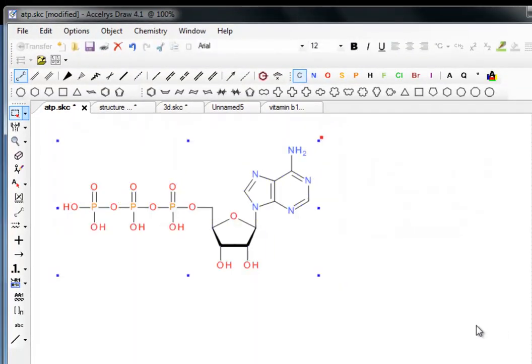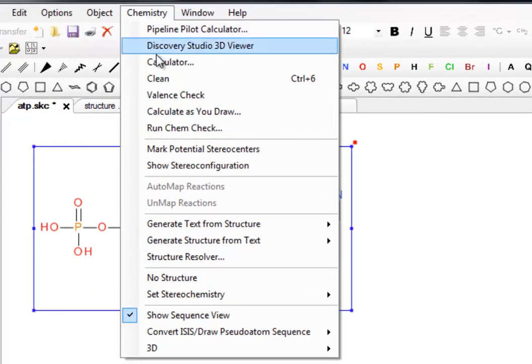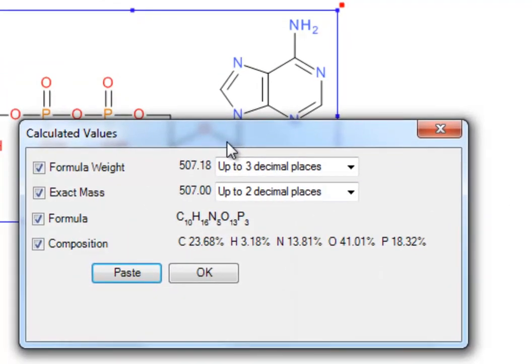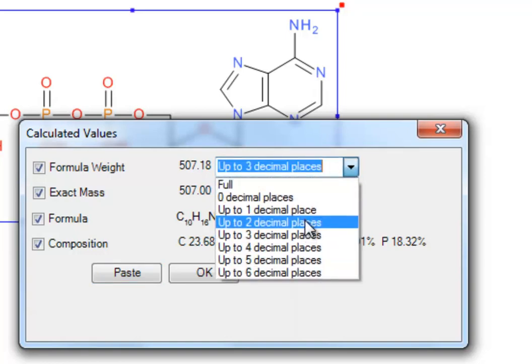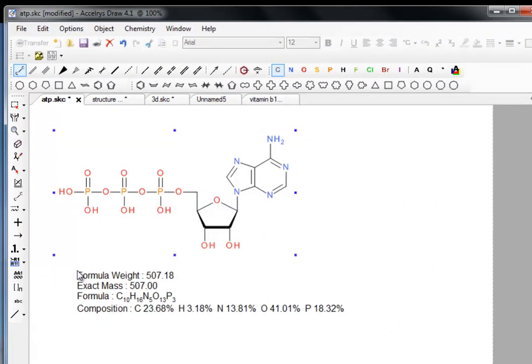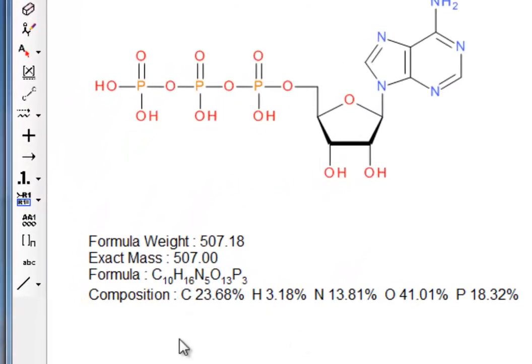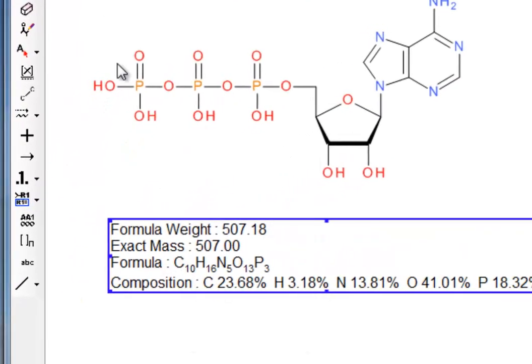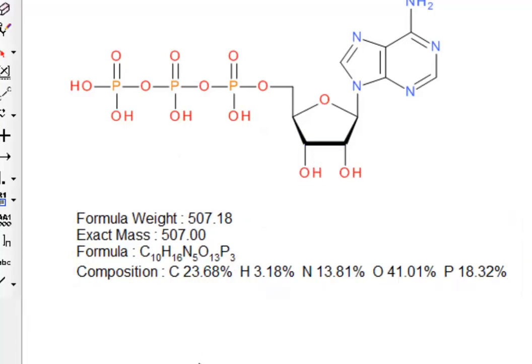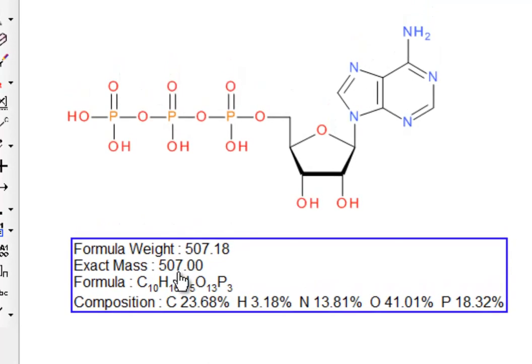I'm going to select the molecule to make it the focus of our interest. If we go to the Chemistry menu, there is an option called Calculator, which when you click on it brings up some useful information about ATP — the formula weight calculated in two slightly different ways. We can set the number of decimal places we want in the answer, and when we're happy we click on Paste. It appears as a text object, which we can move around. That's another useful thing about using the oblong select tool — it's quite easy to move things around.